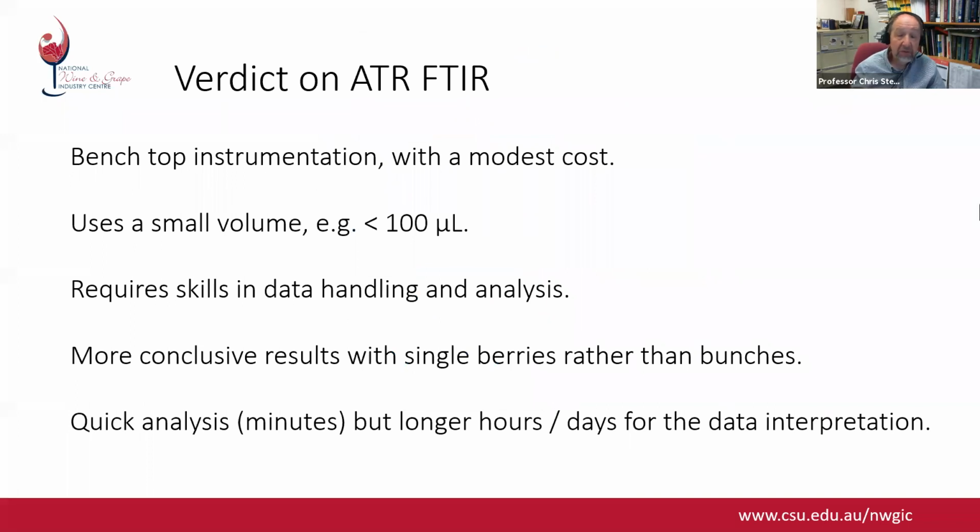So here's my verdict on the ATR FTIR. Benchtop instrumentation, modest cost. I don't know what the figure would be. We're probably talking maybe 10,000 perhaps. I don't know. Uses a small volume, but requires skills in data handling and analysis. We get more conclusive results with single berries rather than bunches. So probably not so good for a field situation.